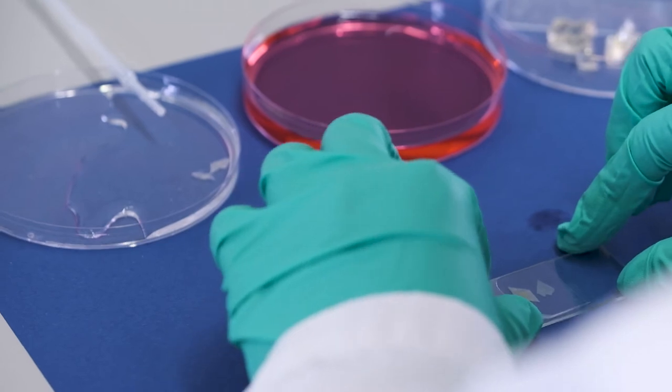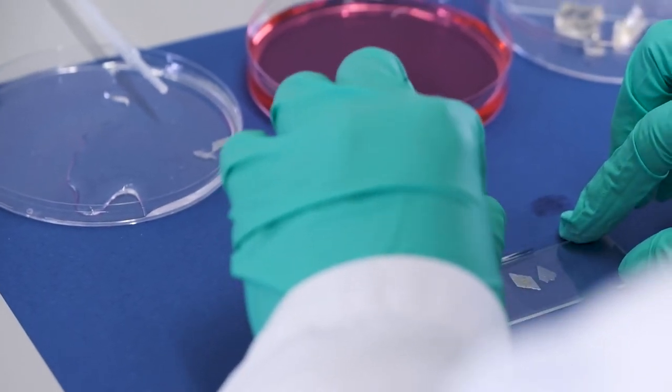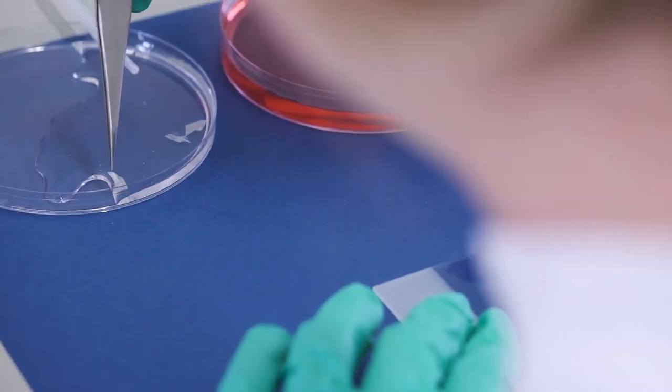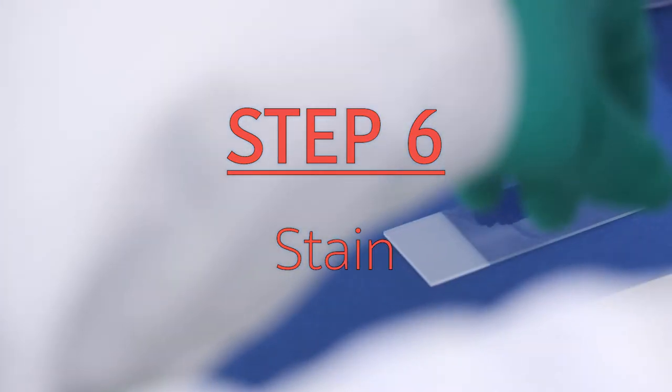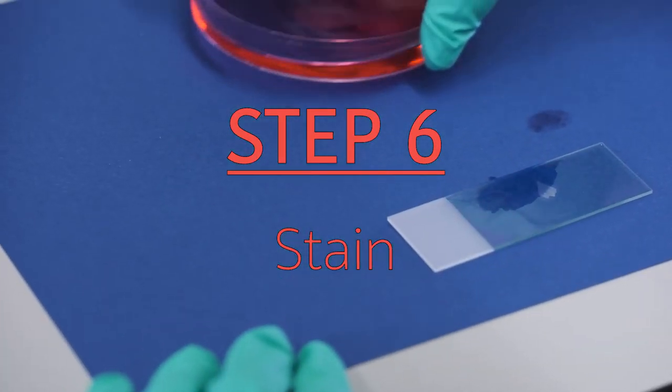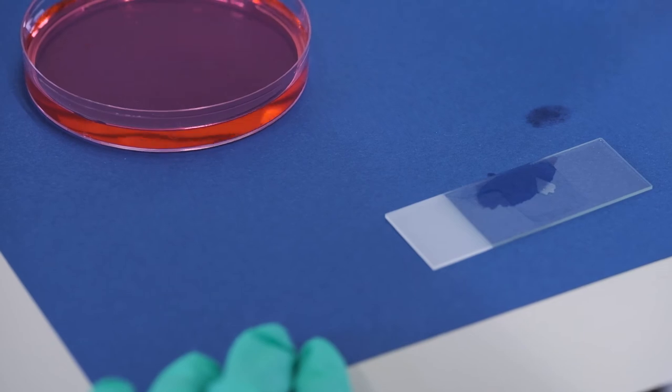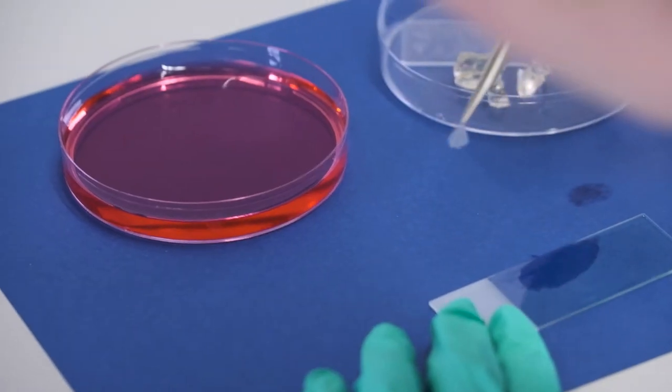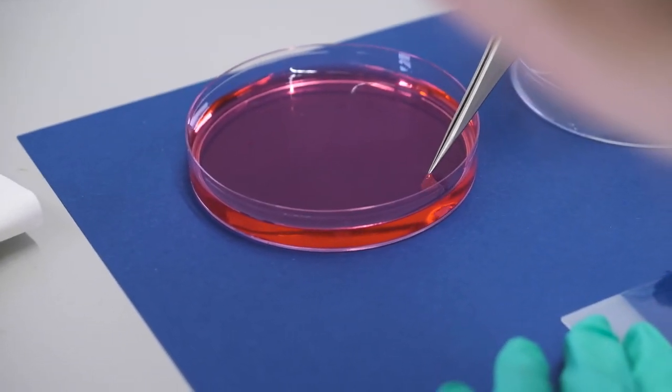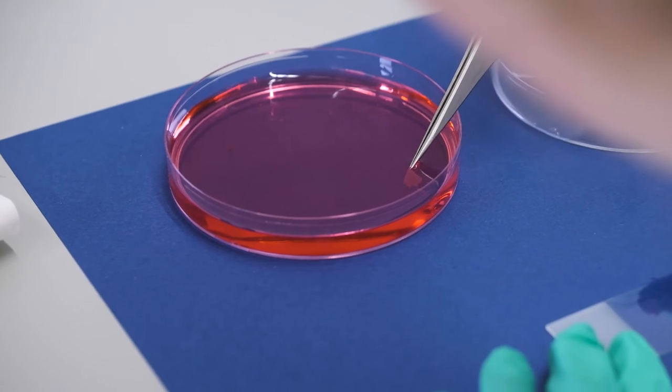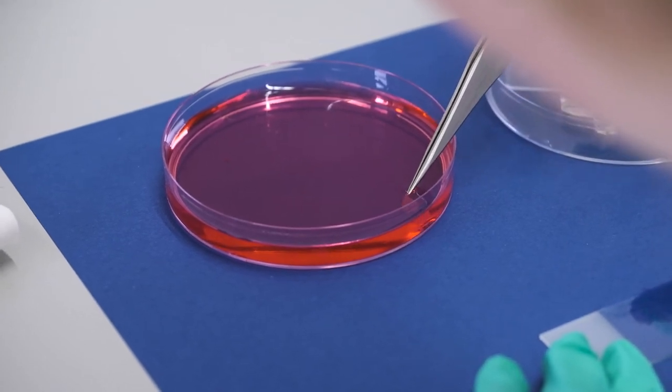And if you have the right one, you take it back to your table, you remove the cover and then you can stain your sample. For example, in safranin, which is pink-red coloration and it will increase the contrast. So you get a better view of the stomata and the epidermal cell boundaries.